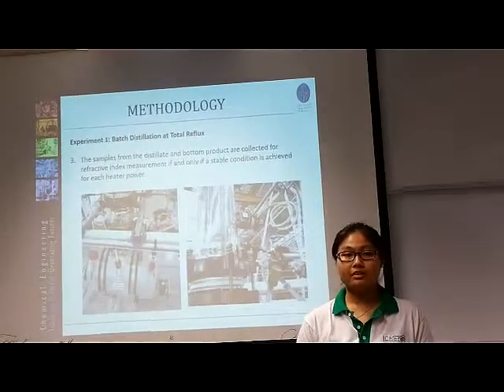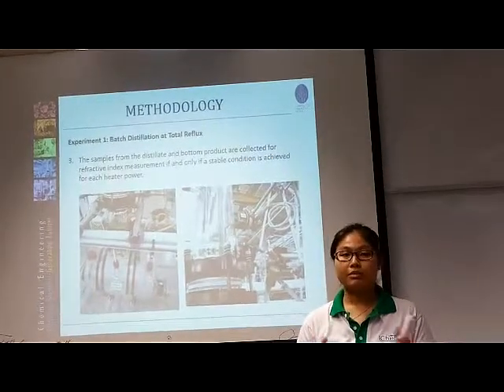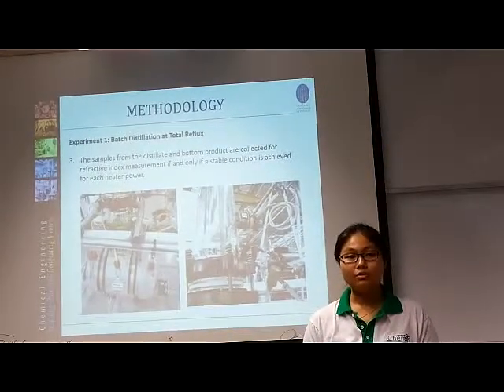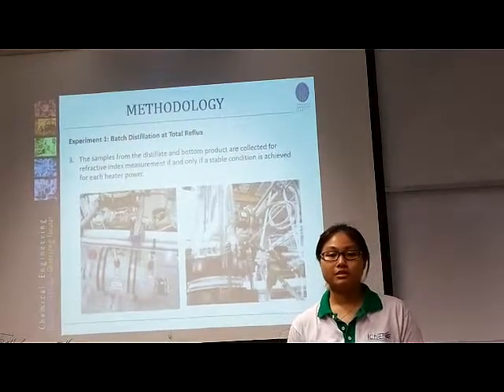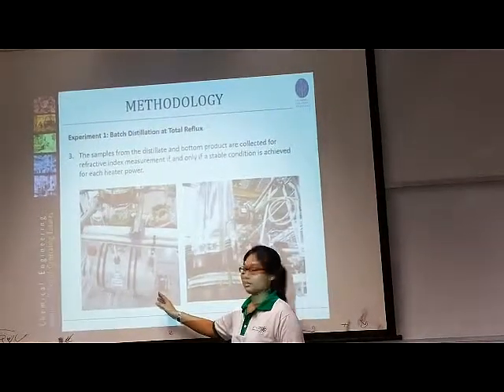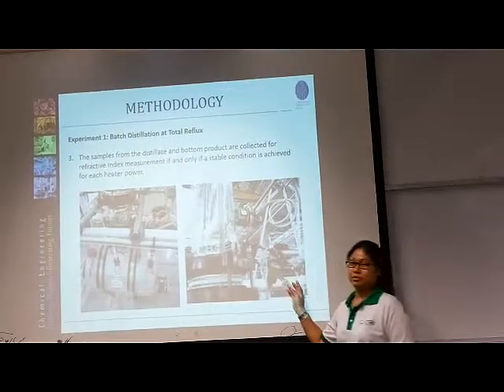The samples will then be collected: the distillate and the bottom product will be collected to measure their refractive index, only when a stable condition is achieved. This will be where the bottom product will be collected, and this will be where the top product will be collected.